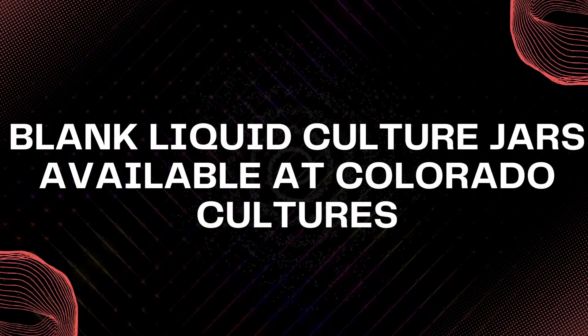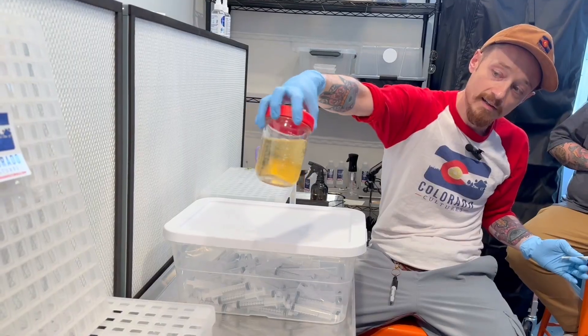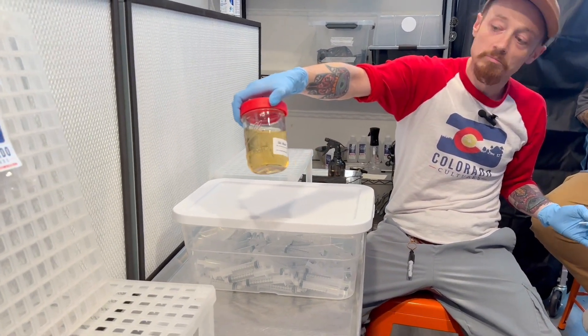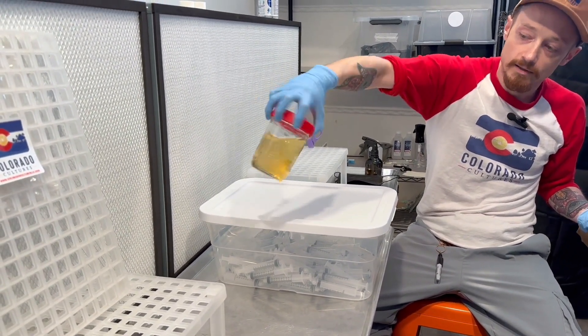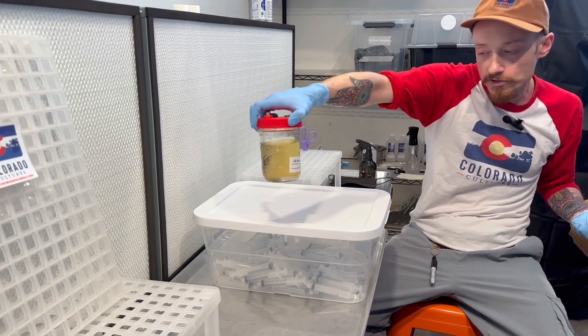This jar was done seven days ago, and you can see how nice and thick that is. I've had it rotating on my stir plate for about five minutes to break everything up nice and good. You can see there's no bubbles — definitely want to avoid any foam on top, so don't be too aggressive with the stir plate.